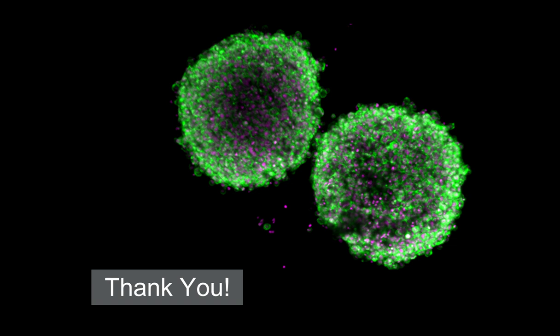They're not attached to anything, so we need to be a lot more gentle with our pipetting and media changes. As you see here on the final slide, we actually ended up with 2 spheroids in one well because of a more aggressive washing. So just take your time, slow down on the pipetting, gently aspirate your media, and very gently replace with your reagent of interest to make sure your spheroids not only remain in the well, but remain as a nice intact ball of cells for your research.